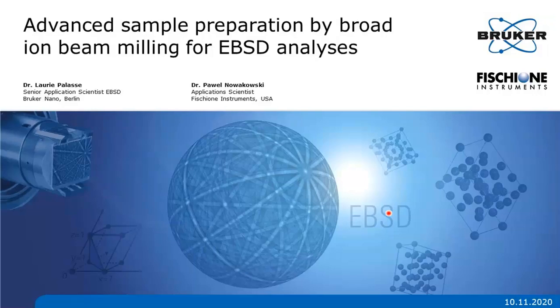And today, Pavel and I will review the challenges and solutions of sample preparation for electron backscattered diffraction analysis.